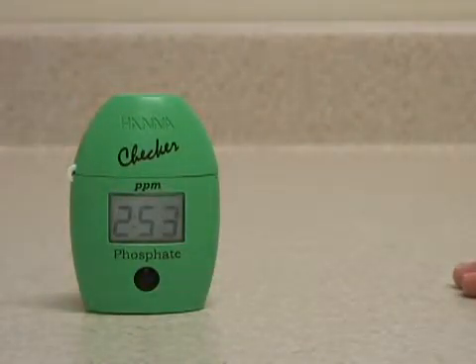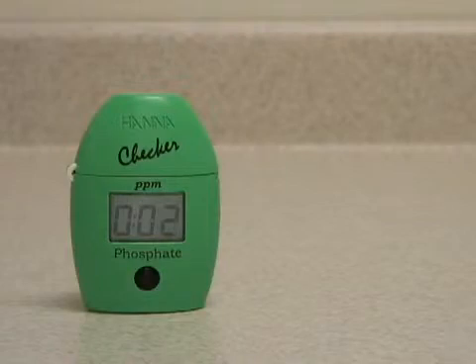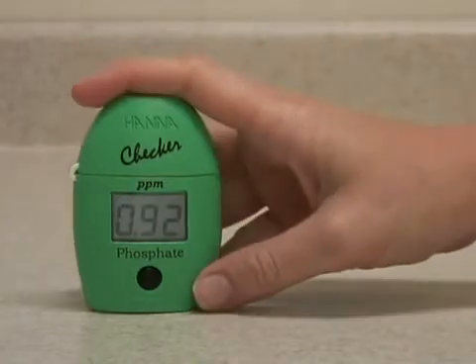After three minutes, it will automatically analyze the sample and display the reading. You see the meter now displays the concentration of phosphate in parts per million that was in the water sample.